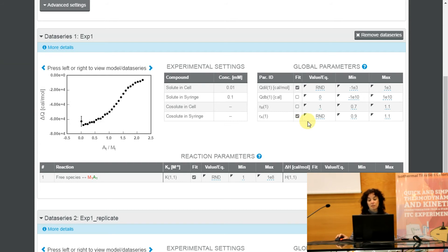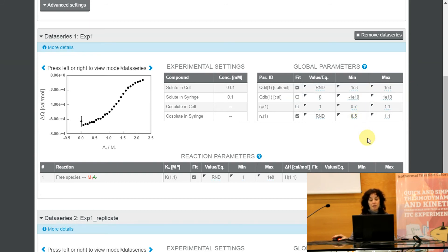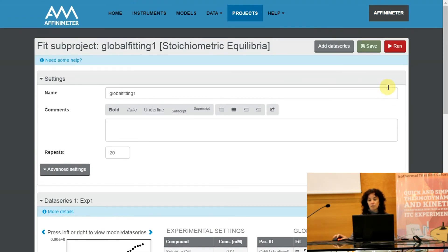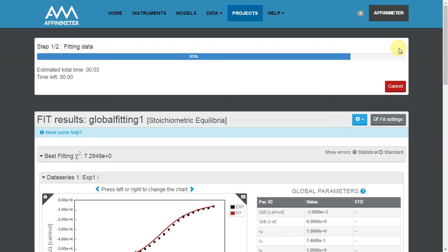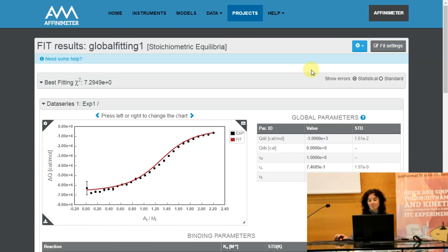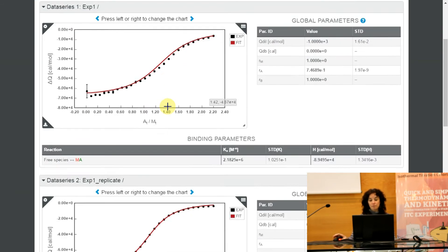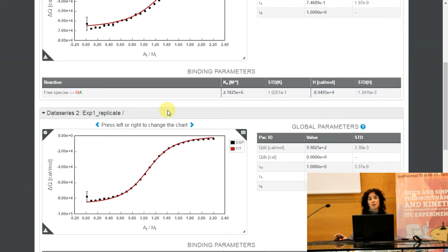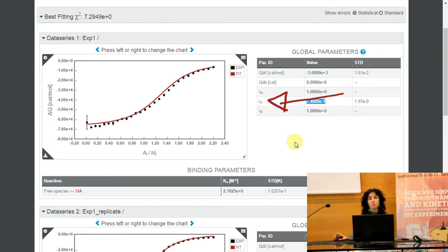For this I will check the Fit box of Ra. I can also modify the minimum and maximum boundaries of Ra just in case, and I will run the project again. As you can see, this analysis is much better than the previous one, and this means that in the two experiments I performed, in the first isotherm there was a deviation between the nominal concentration of species A and the true active concentration of this species.